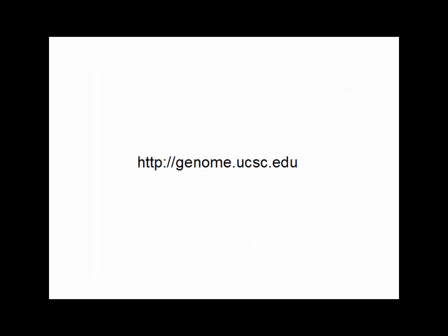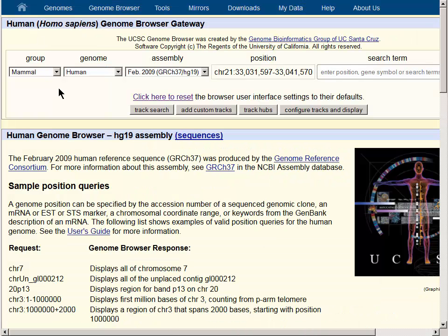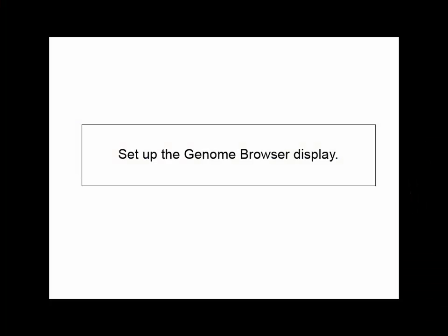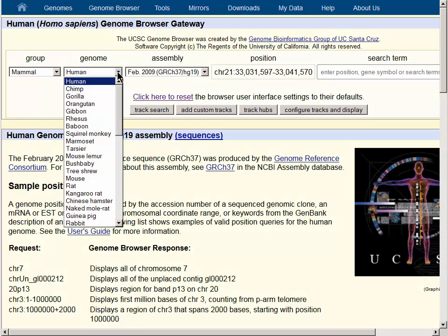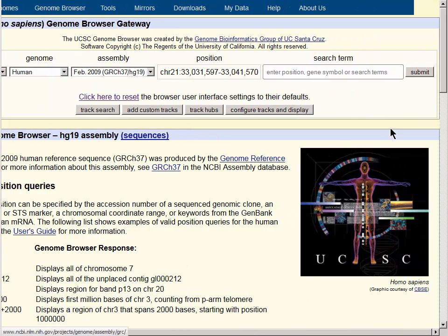We will navigate to genome.ucsc.edu. On the main page of the Genome Browser, there are two links in the upper left-hand corner which will take us to the main gateway page, where we can choose our organism of interest. We will work with the human genome, and we will use the Click Here to Reset button, which takes us to the default genome assembly with a particular set of data tracks turned on. The Submit button will then take us to the main graphical viewer.